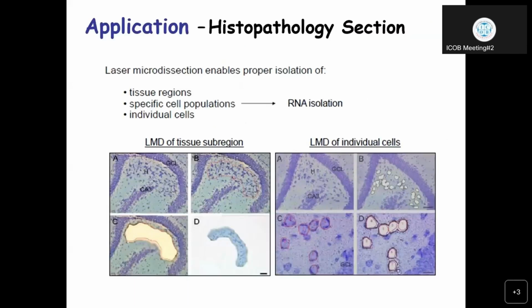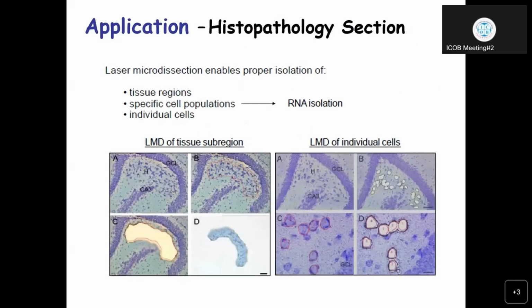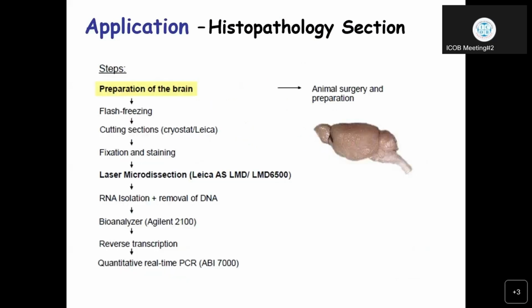For the applications, histopathology is a main application of the LMD system. For histopathology sections, the first step is to prepare the tissue that you want to dissect.